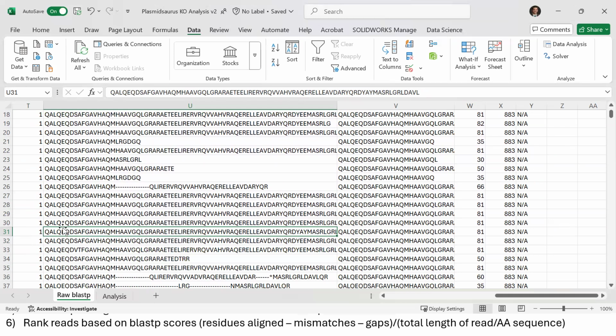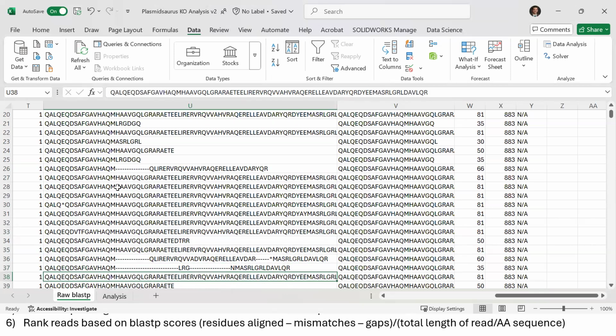or if it might correspond to a Cas9 mutation. What I mean by that is you can see here that it occurs at this glutamate. While if we go back to our gene sequence and look at our Cas9 targeting data, we don't expect to see a mutation that early. The first mutation should happen here at this HAQM motif. So like you can see there's several reads where that's the beginning of a deletion because Cas9 cut there and then somewhere downstream.